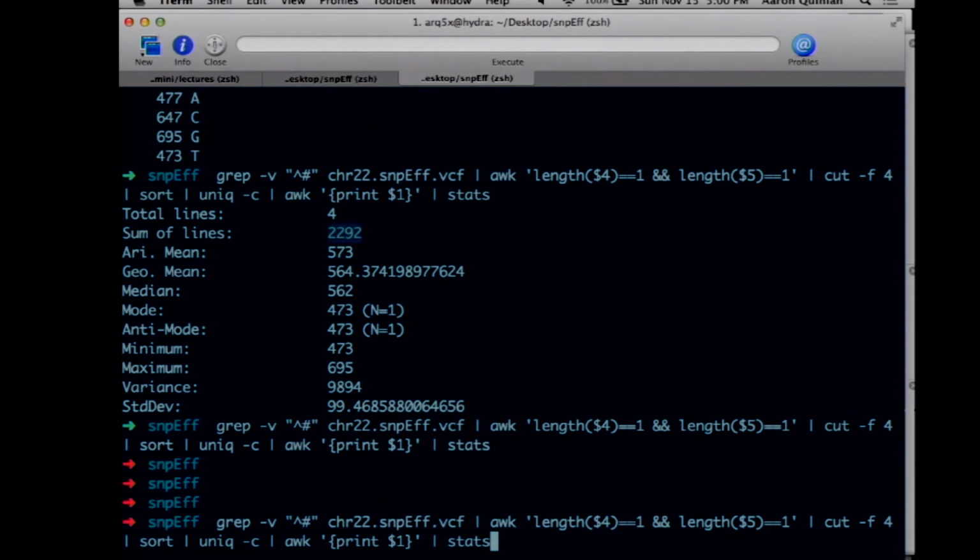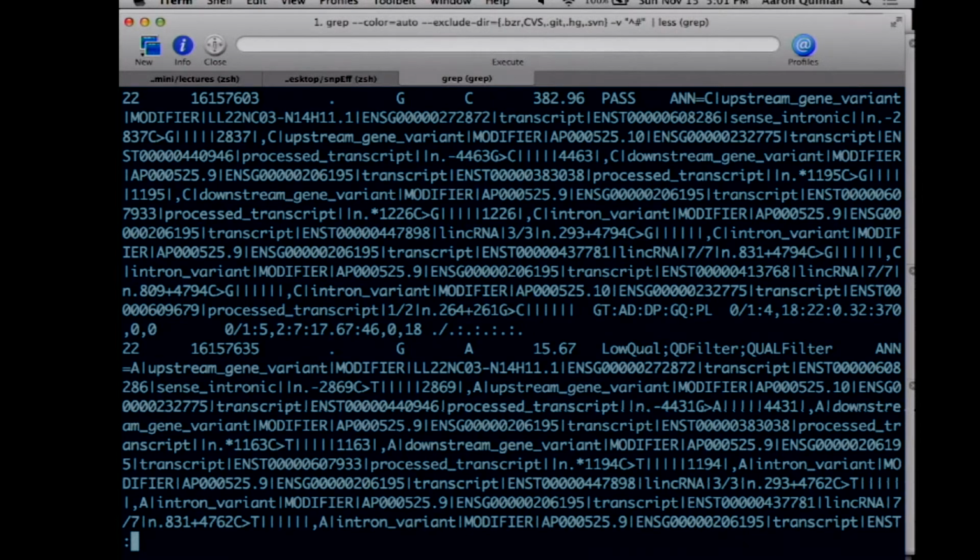Yeah, so there's a really clean way of doing this, and then there's a hacky way that'll take less time, so I think we'll choose the latter. Somewhere in here there should be the... no, we didn't run it to ask for the HGNC gene name. So a gene name like TP53 is not going to be in here. It's all these Ensembl gene IDs. But we can still get a count per Ensembl gene ID.